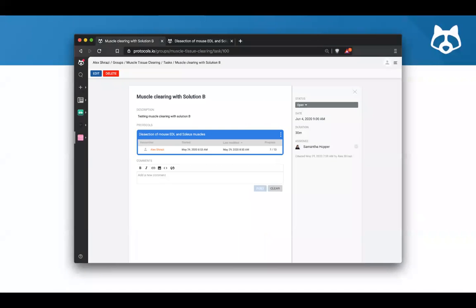And as you can see, when I go back to the task, whether you're going back to the tasks yourself, or maybe a colleague or manager is looking at how far along you are on this particular task, I'll see that my progress is step 7 of 13 on this particular protocol. And so it's a nice way to really track what you're doing, what others are doing, so you know that things are in alignment when you are in the lab.